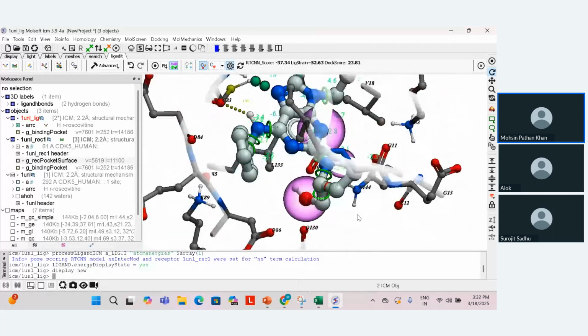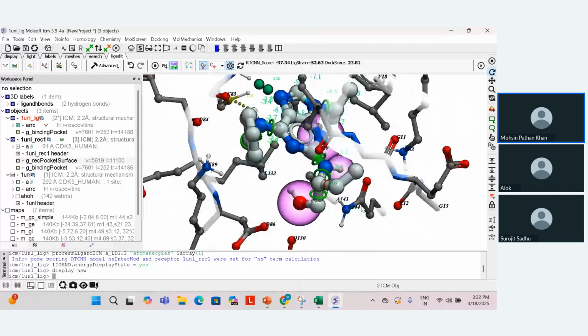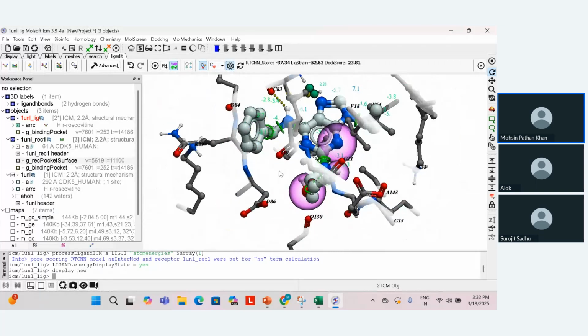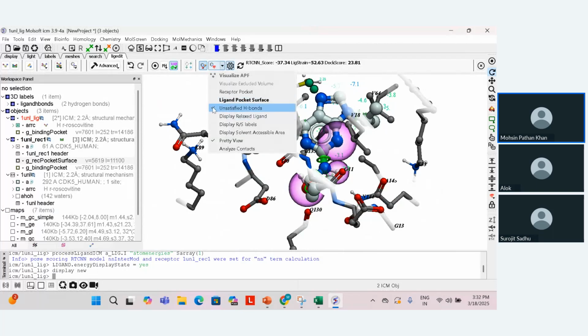that particular atom will be forming clashes with the protein of interest. So we'll see how we can visualize those clashes also, by adding some functional group at a position where there is no space to grow our ligand molecule, and how they can be involved in clashes between the protein and the ligand molecule. This way we will perform visual analysis of our binding site.